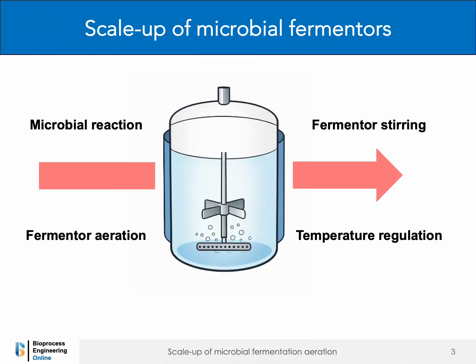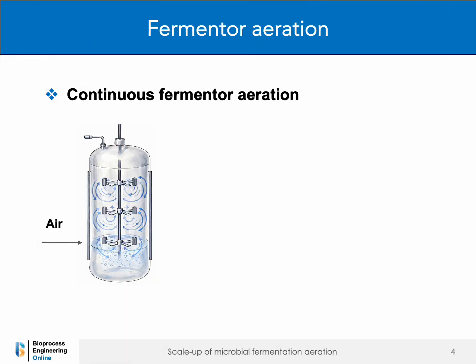Scale-up of microbial fermenters involves the scale-up of the major functional elements of a fermenter, namely, the microbial transformation reaction, stirring and mixing, aeration, and temperature regulation. This tutorial focuses specifically on the scale-up of aeration in microbial fermenters. This tutorial addresses aeration scale-up strategies in microbial fermenters.